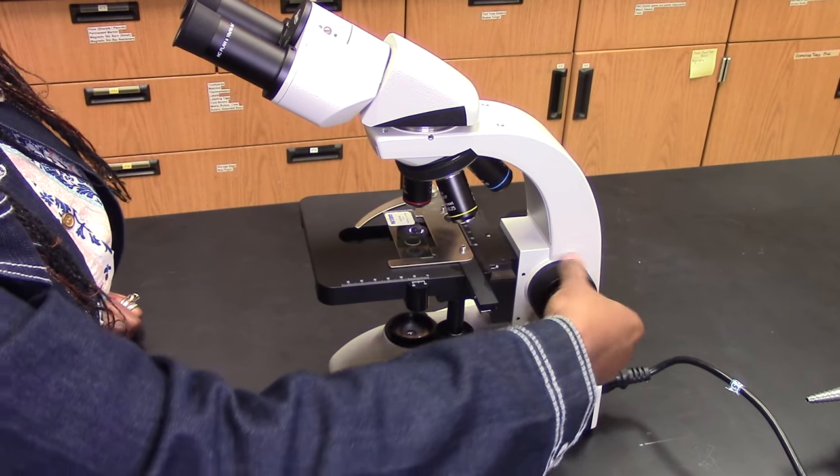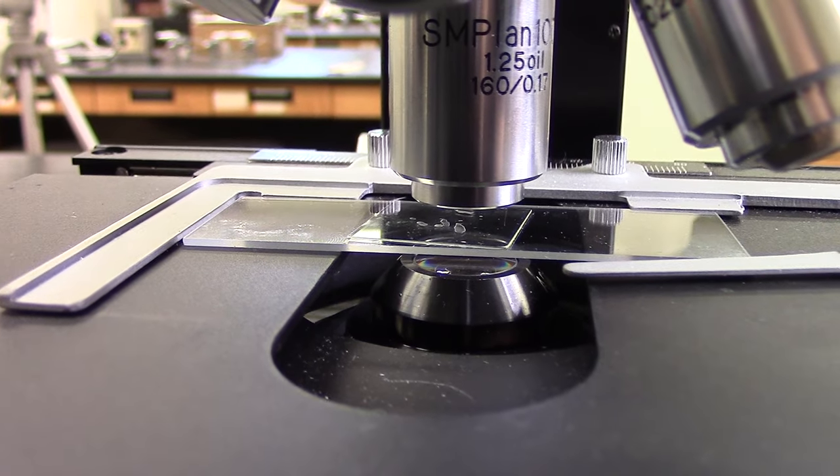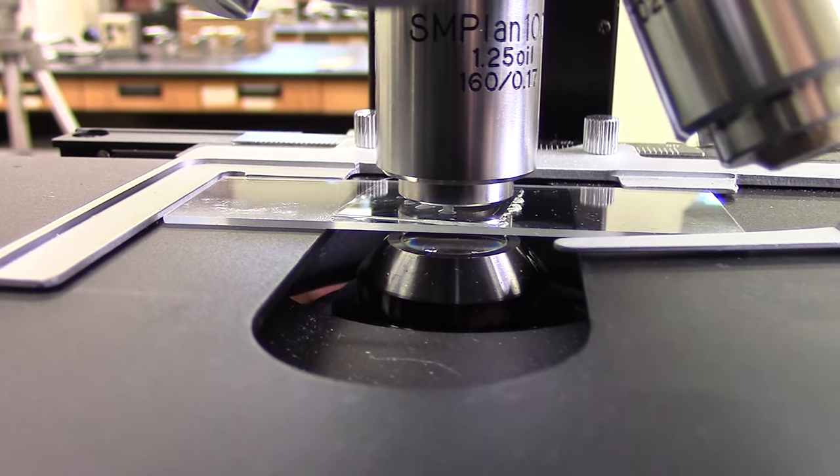When you use the coarse focus, the stage moves up and down a lot. Using any objective other than the 4x may cause it to smash into the slide.